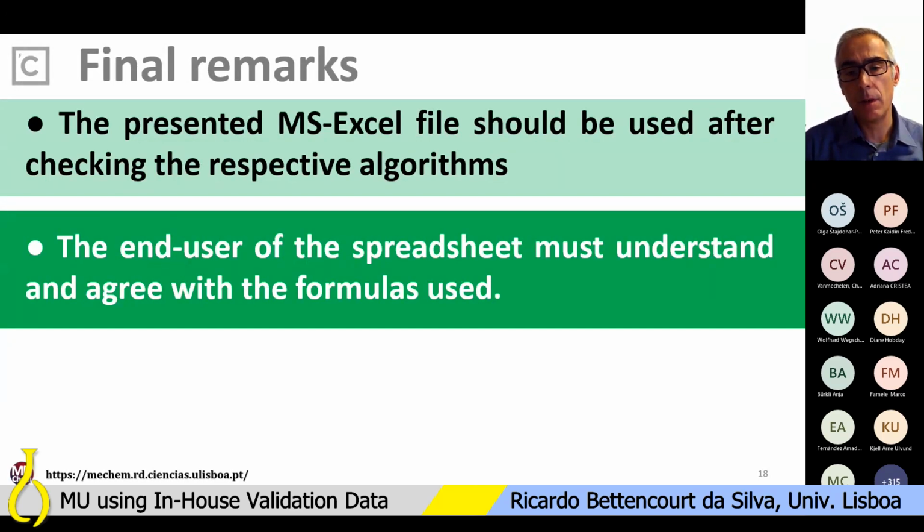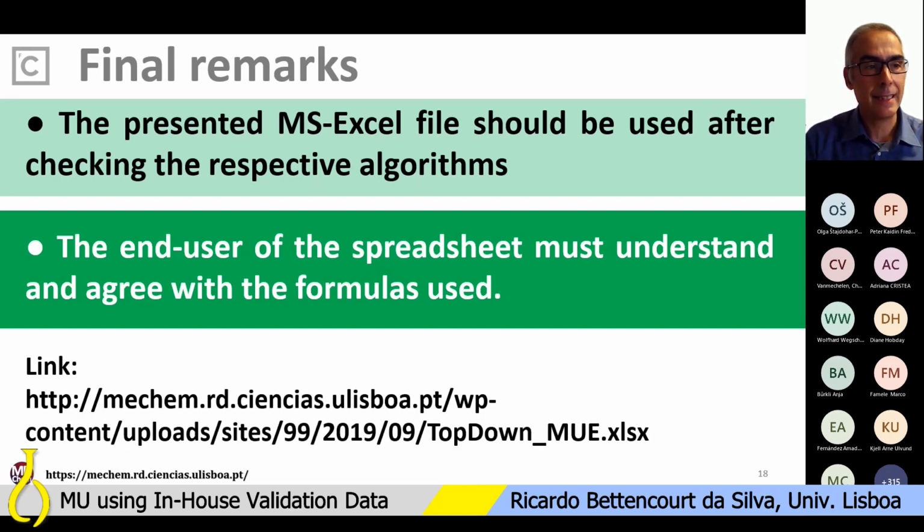If you are an accredited lab, you have to check all your spreadsheets to be sure that you agree, to be sure that formulas are fine, and that you understand what is being done, and that you understand both the scope and limitations of these algorithms. I will make this link available in the chat. It will not be there forever. I will monitor the number of downloads, and then I will remove it from this link.